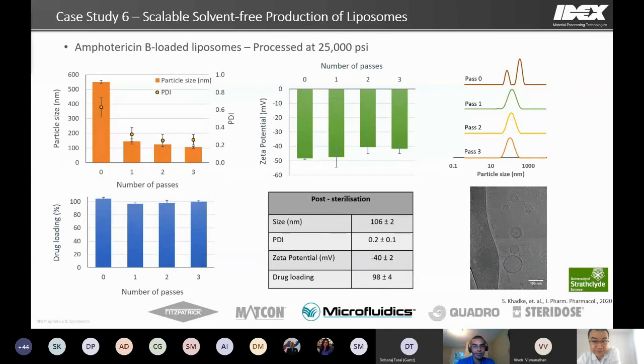For this solvent-free process, how do you perform mixing in the initial phase? How do you ensure thorough interaction of lipids with a hydrophobic and poorly wettable API?